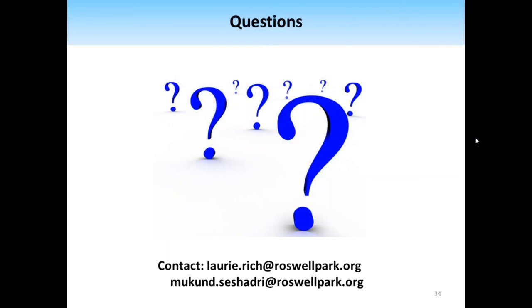Thanks, Laurie. We actually have our product manager, Drew Heimler, here, and he suggested you can image for tens of minutes and just visibly watch and see if you're seeing any difference. Oh, you're saying just imaging over 10 minutes to see what the fluctuation is? Yeah, absolutely. And I'm sure you'll see some areas of the tumor which were well oxygenated changing, maybe not being oxygenated at all, or some areas that show up. So that would be a very interesting study to perform.